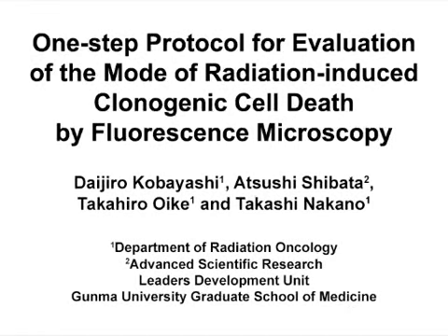The overall goal of this assay is to evaluate the major modes of clonogenic cell deaths induced by ionizing radiation based on the characteristic morphologies of nuclei stained with DAPI. This method can help answer key questions in the field of radiation biology.